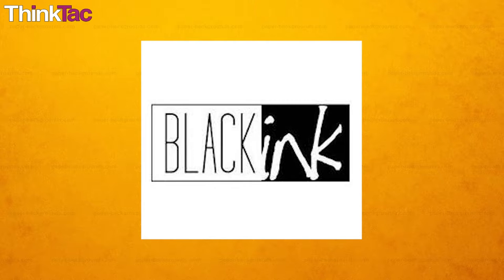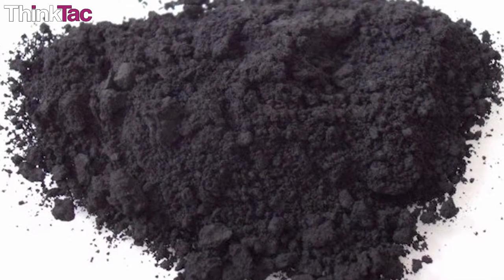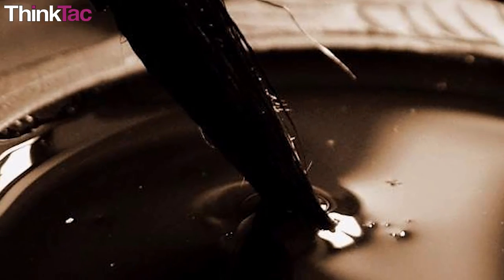Let us look at black ink. We know that black ink is black in color — it would be silly to even ask what color it is. But is it actually made of smaller black components? To find out the different components of black ink, and to see if those components are also actually black, we can perform a chromatography experiment.